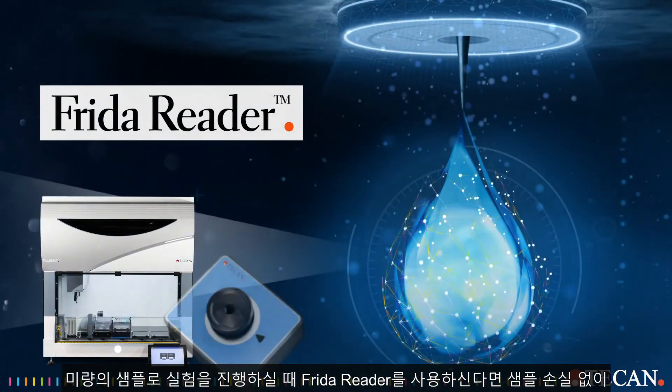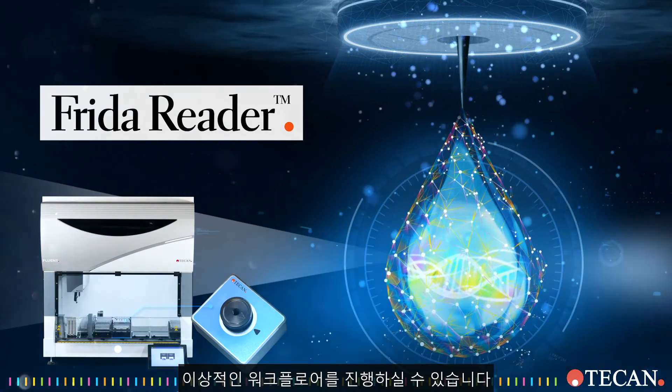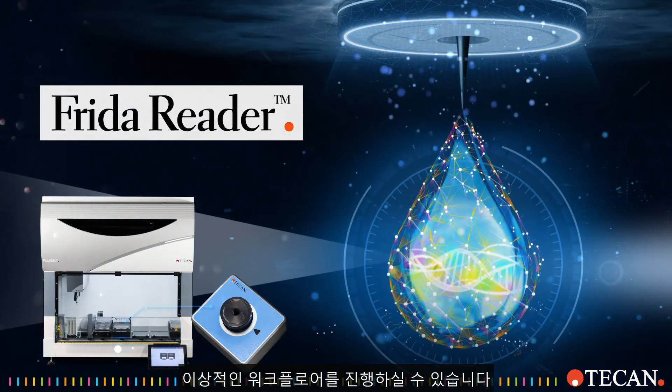When samples are precious, trust FridaReader. You can finally run ideal genomic workflows without wasting a drop.